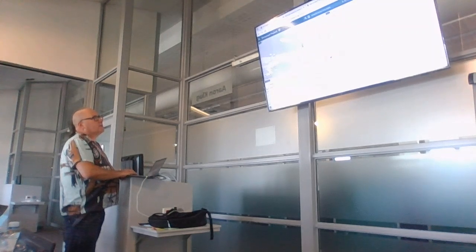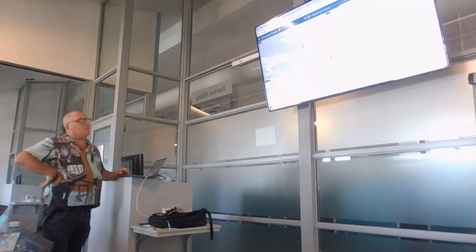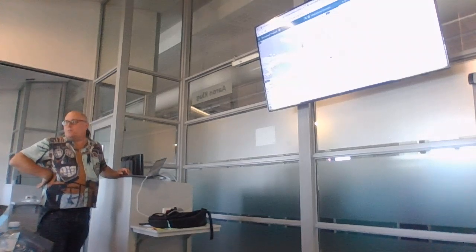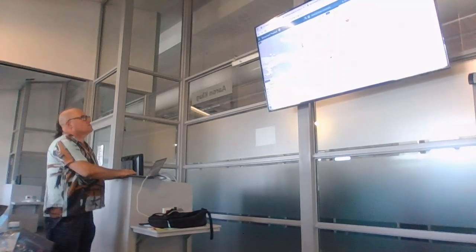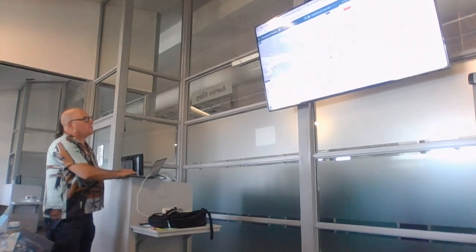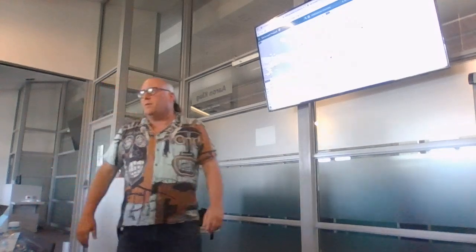I'm just trying to, maybe it's this, but it's this one right here. We can choose which color should we use. At the moment it's using the site column to color, okay? But I could color by source, okay? I'm going to switch this to be relating to the SRA. And if we look at the phylogeny done like this, then what do we see about our samples and their relatedness?